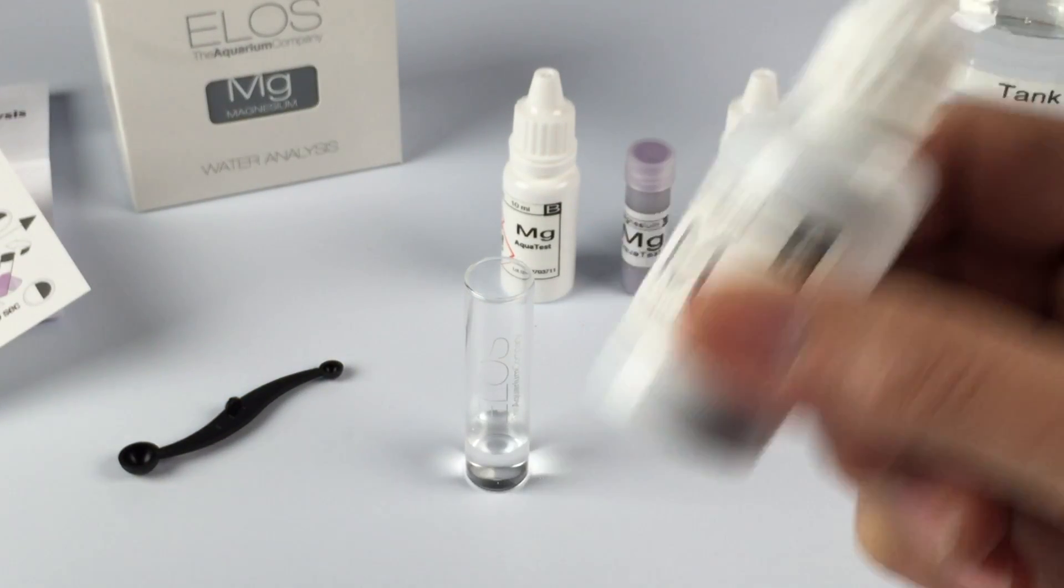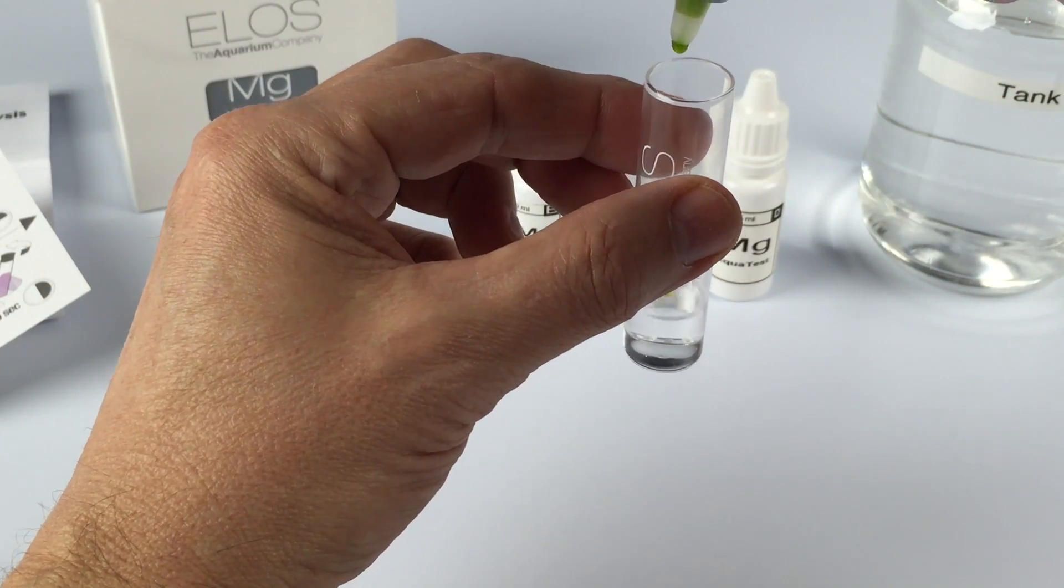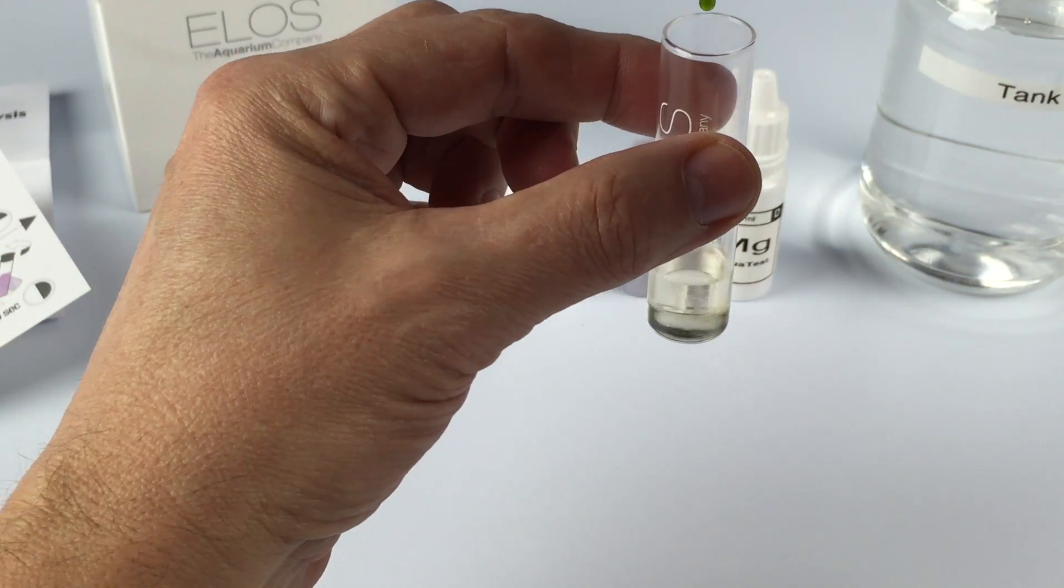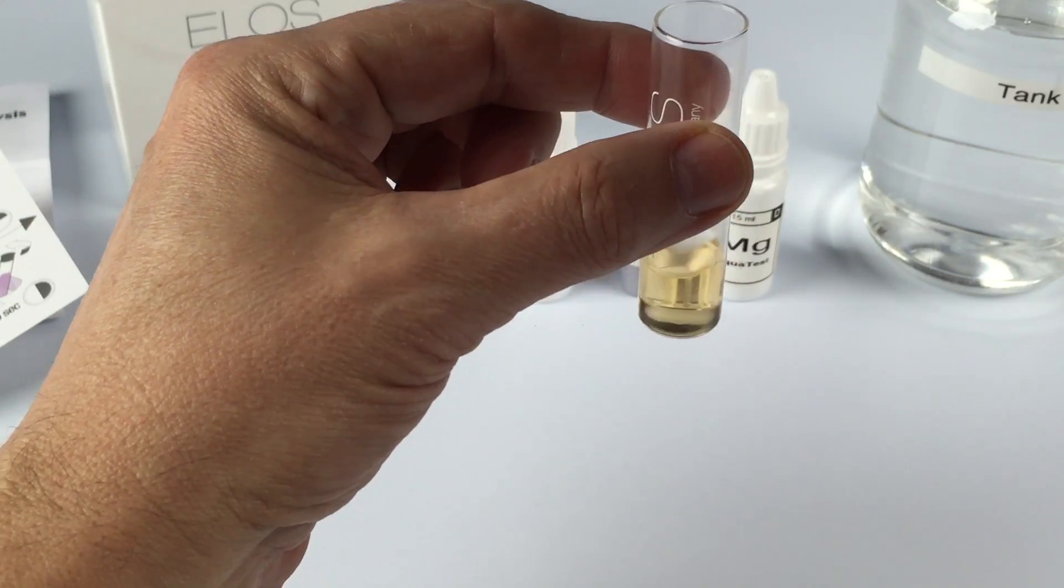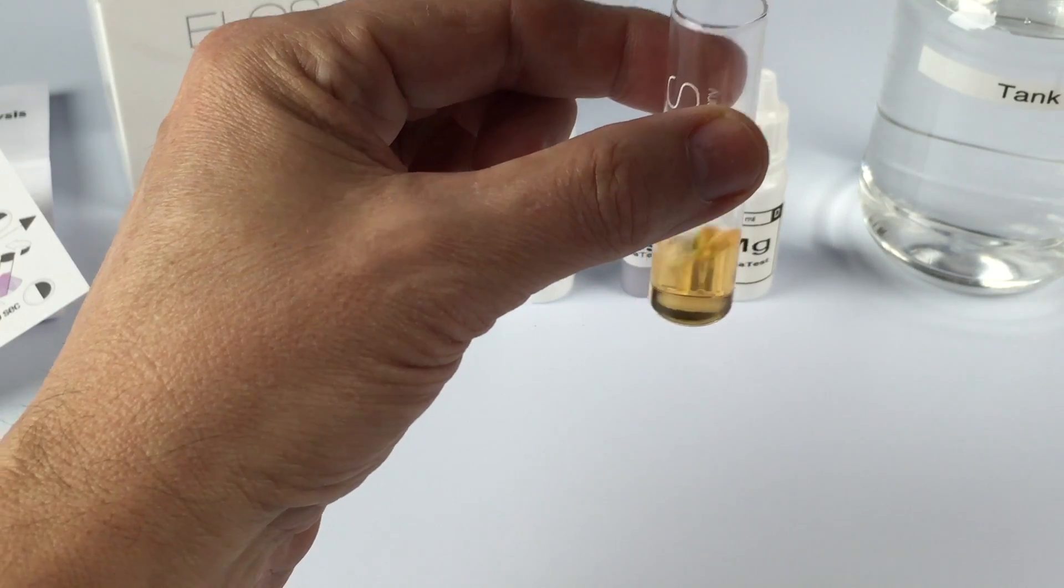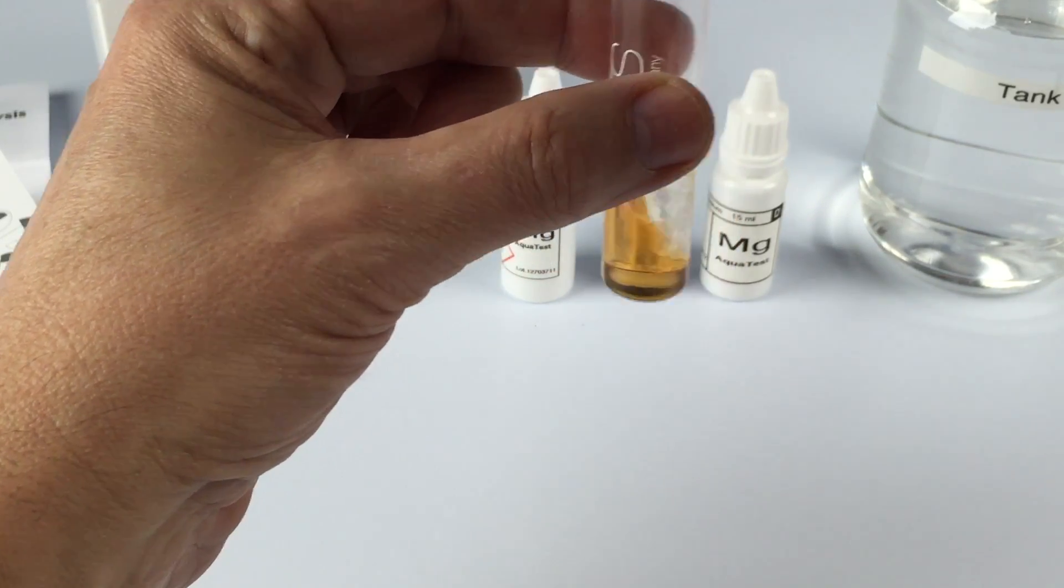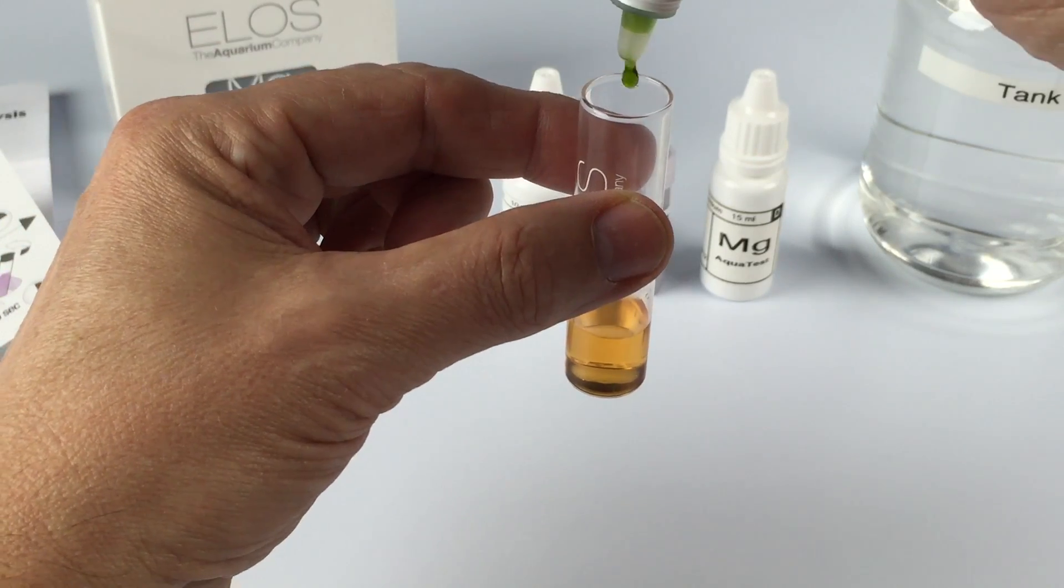Shake Part A for 15 seconds. Next, you're going to add it drop by drop, counting them and shaking the vial after each drop. I'll give you a heads up: you'll probably use 28 to 32 drops to get this to turn from peach to green, and you need the green color to stay green for 20 to 30 seconds after you're done.